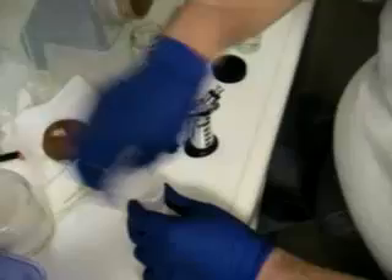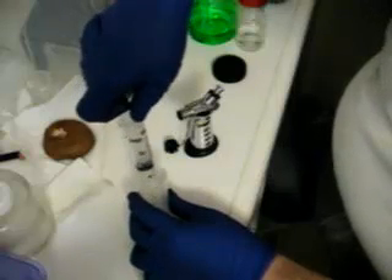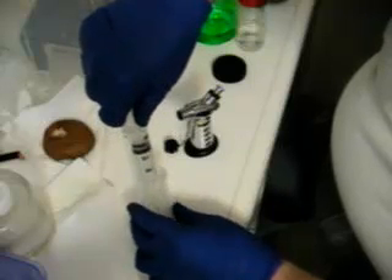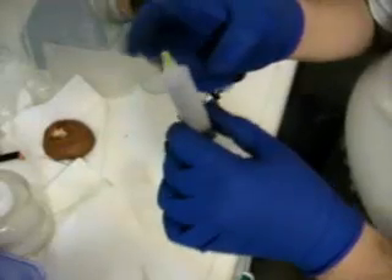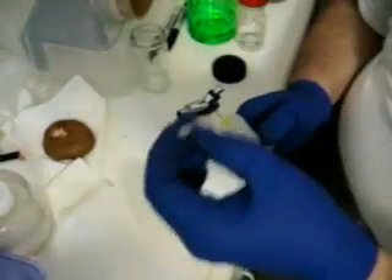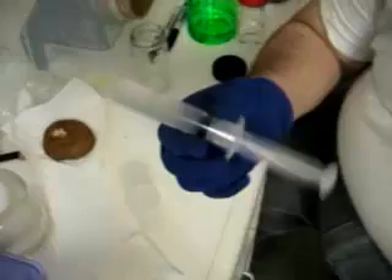We're just going to take the syringe and draw it off. Be careful that you don't draw air in here — just water — because air can have contaminants in it. And there you have a spore syringe.